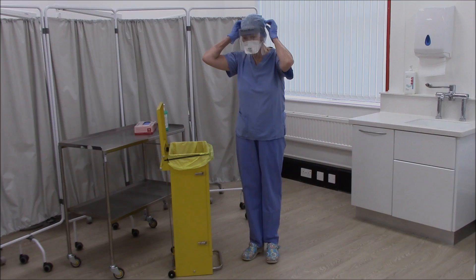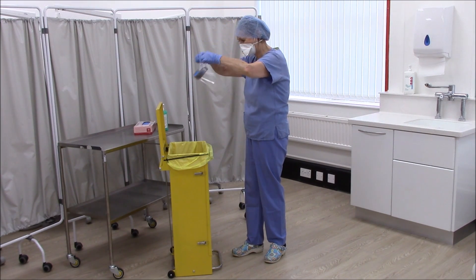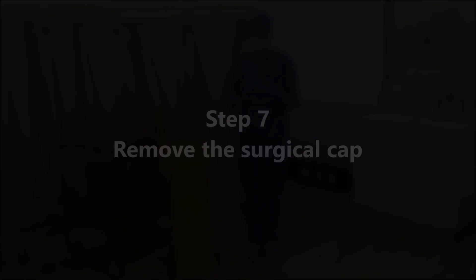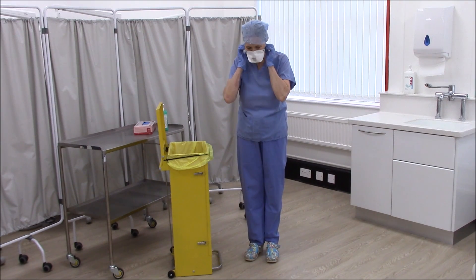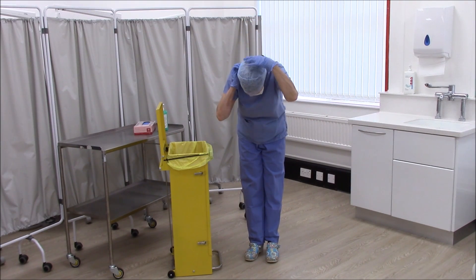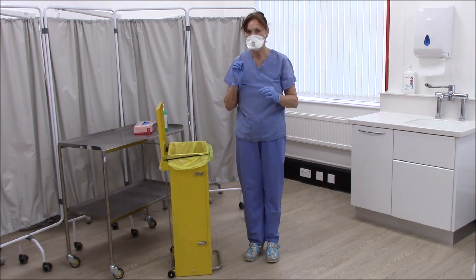Remove the full face shield. Remove the surgical cap from the back and discard into the clinical waste bin.